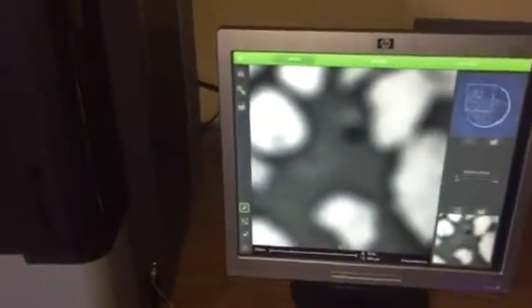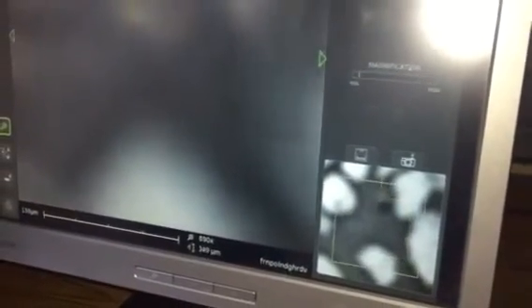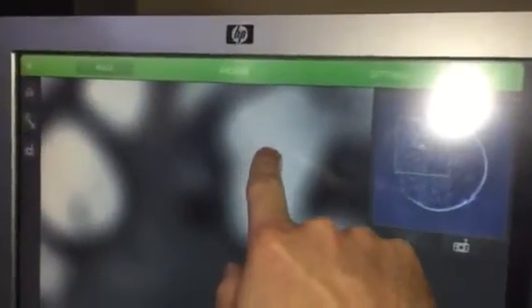This is the navigator's seat, right next to this little dial, and this will be the assistant navigator. Both these jobs are very important. The navigator has two tools: the zoom button, which helps them zoom in and zoom out - clockwise is zoom in, counterclockwise is zoom out. They also control where to center on screen; wherever they touch, it will center. You can also center from this screen when you're really getting ready to move to look at something totally different.